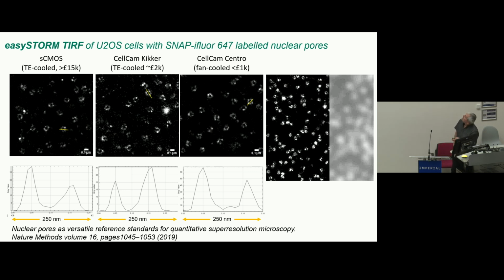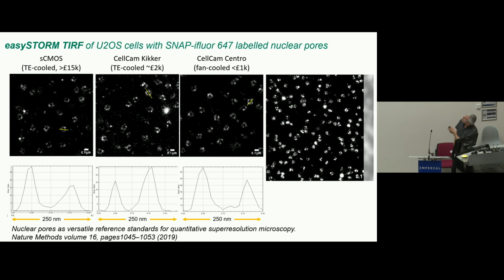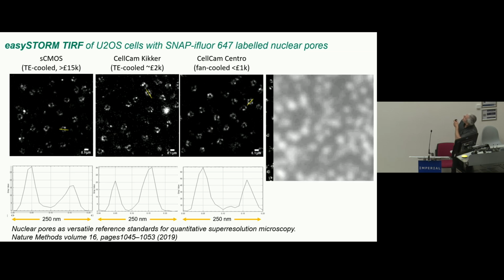Let me show you. This is called the nuclear pore, this structure that you see here. And under 100x, you barely can see through them.